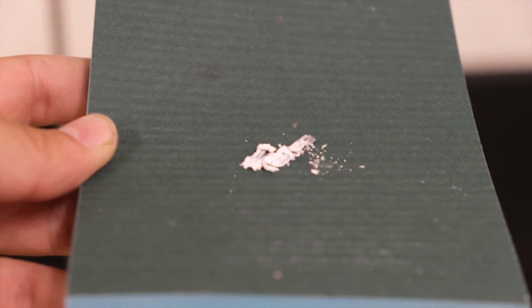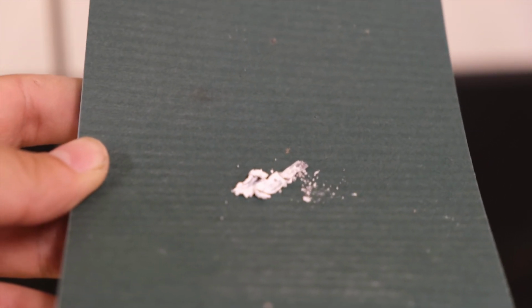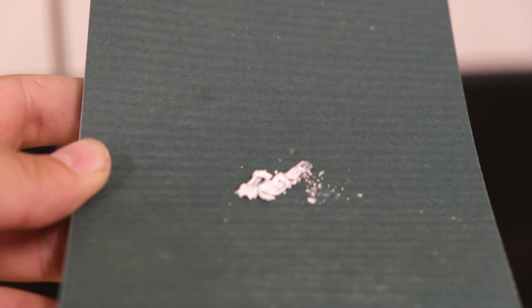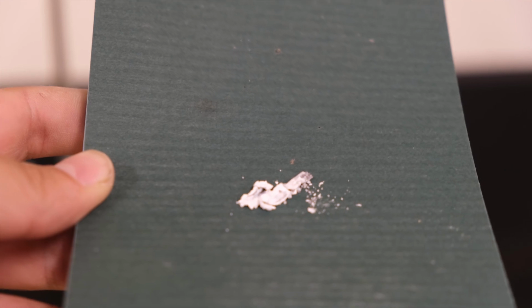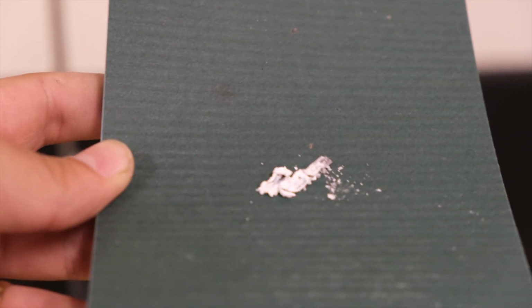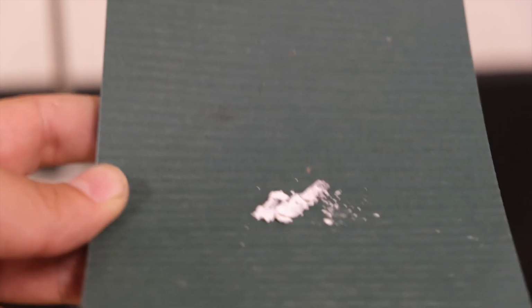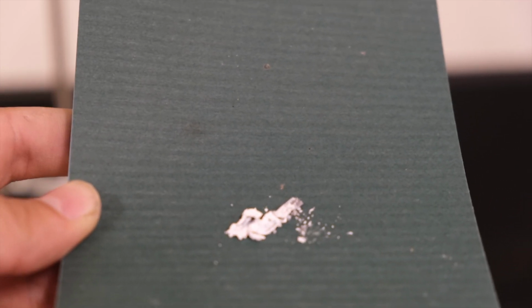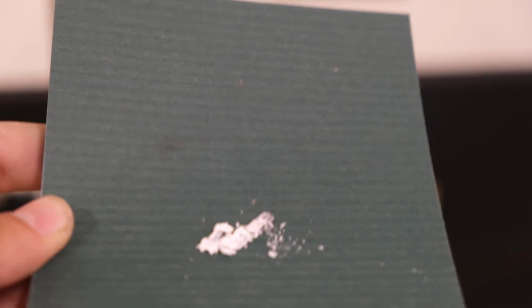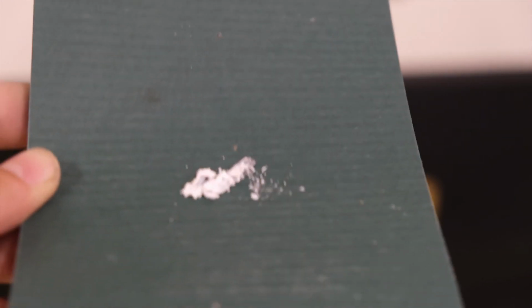All right, and there's that magnesium oxide product that I was telling you about. As you can see, it's kind of in the shape of that magnesium ribbon, but obviously its texture and look are different. It's a white powdery substance now compared to the shiny metal ribbon we had before. And one more time, your question is, if you start with 5 moles of magnesium wire, how much magnesium oxide is produced?